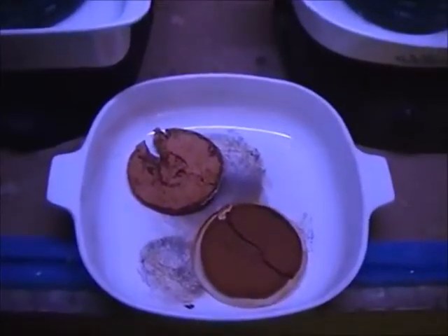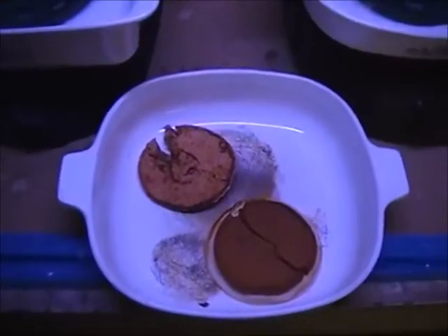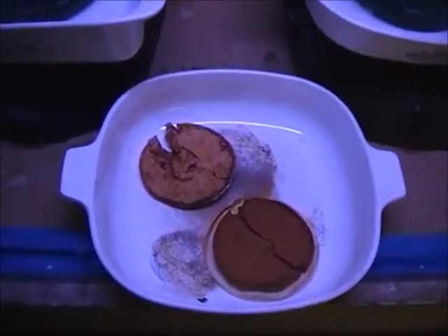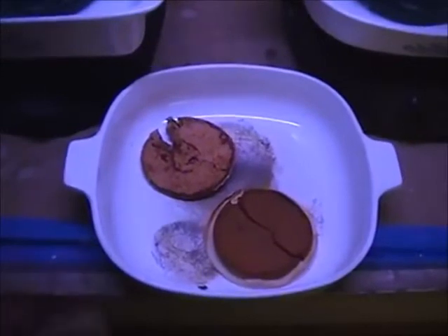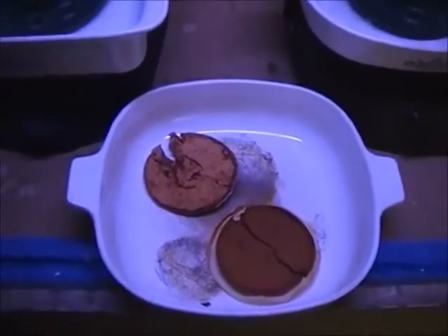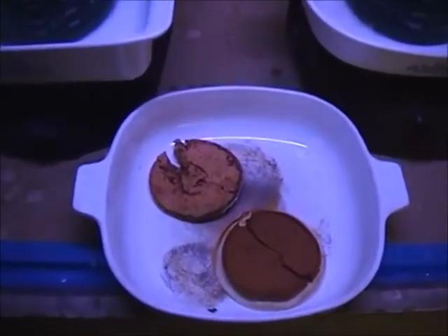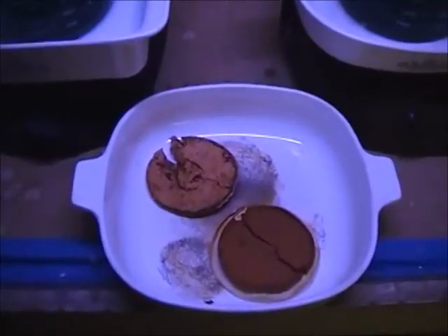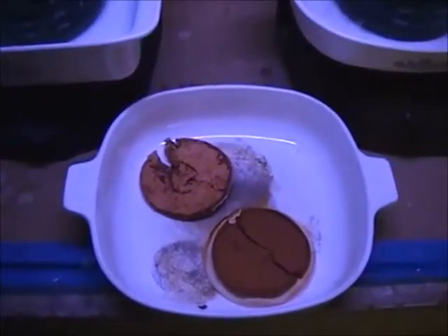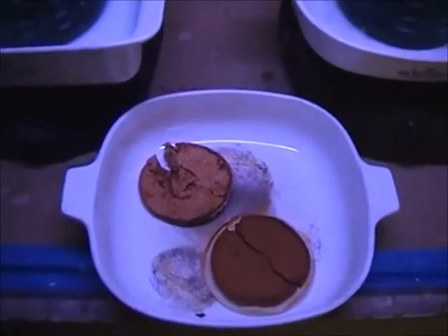So the hydroxide step is one that takes some time. Now when we adjusted the pH of our formate solution, we only had two chemicals to contend with, formic acid and sodium formate. But whenever we use sodium hydroxide to precipitate these metals out of solution, we have all kinds of metals and all kinds of side stream reactions going on, and it takes a while for the equilibrium of the solution to balance out. That's the reason we were having some problems with our pH testing, as it would go up and go down. It's because at the same time, the chemical solution is trying to balance itself out. So you've got a lot of chemical reactions occurring.